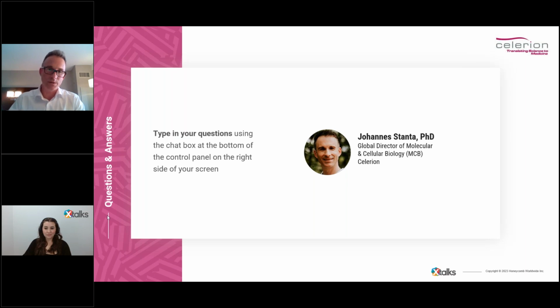And one result above the limit of detection will automatically make it a positive result again. So there's an influence of that aspect, where the sample collection together with extraction and then the highly sensitive qPCR method that you have in the end contribute to the uncertainty within that result. So I don't believe the results are genuine. Someone will not be not shedding and then shedding again and then not shedding again. I think the issue here is definitely, from my point of view, technical, experimental, and based on the extraction limitations and the sensitivity of the methods.